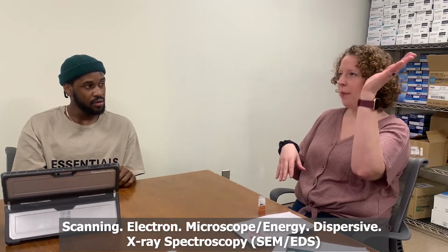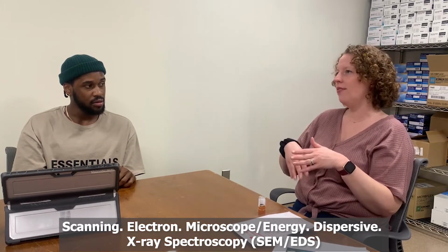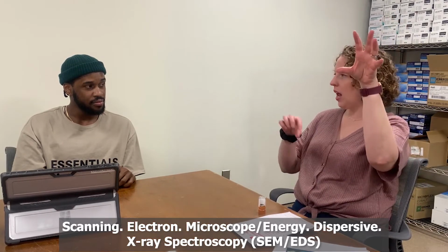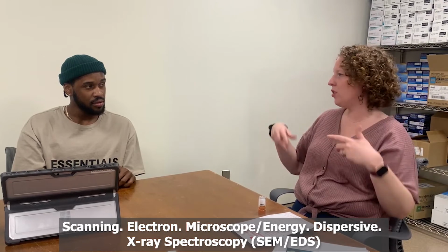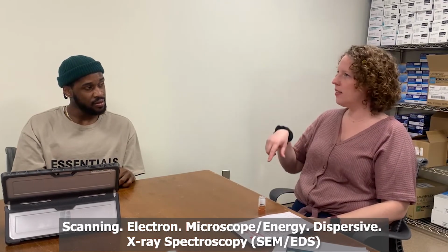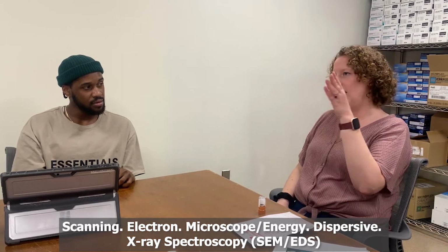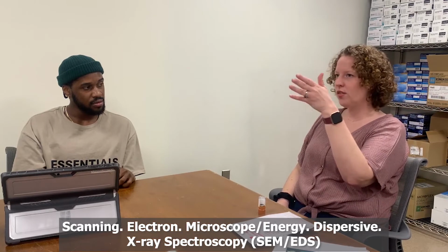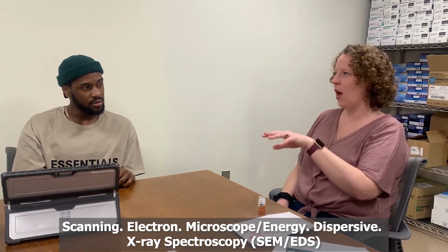So there's electrons popping off, and then there's X-rays coming off, and electrons coming off makes your image. X-rays coming off gives you your elemental analysis. Gotcha. So it comes in the form of peaks, and those peaks are unique to each element. So we can just scan those peaks and say, okay, there's these several elements in that particle.